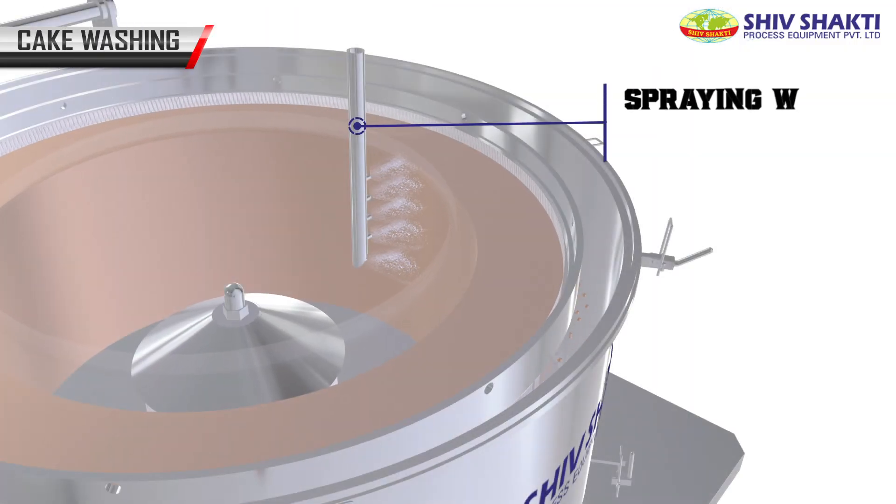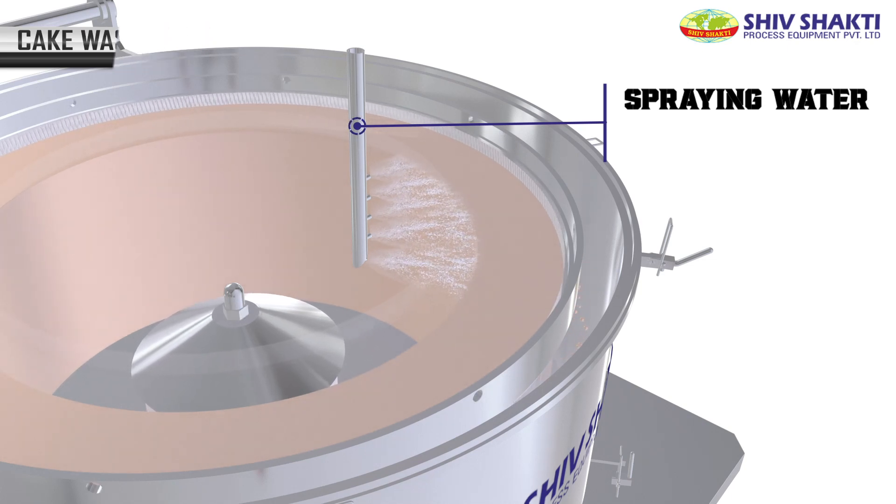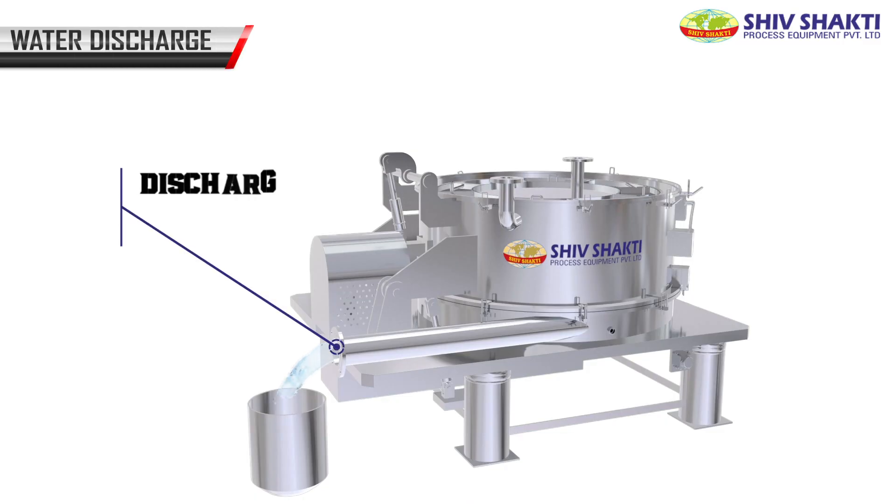Water is sprayed on the slurry that is stuck on the bag to remove necessary impurities. The slurry water is then discharged, and the required material remains inside the bag.